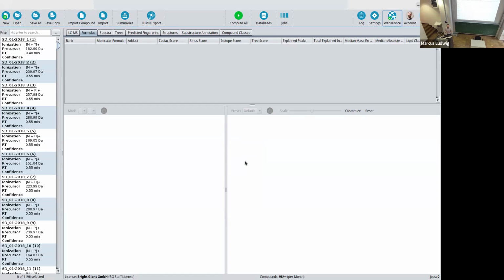The nice thing is that if you want to tweak your pre-processing, you can use MZmine for that, because there you can adjust all the parameters and have a more detailed look at your data, how it's aligning and everything. This can be done in MZmine. Sirius is not about giving you all these features for pre-processing. We have a swift way of getting your data in if you want to just start, but if you want to optimize your pre-processing, this is done in MZmine.